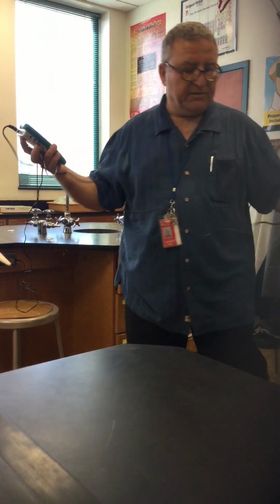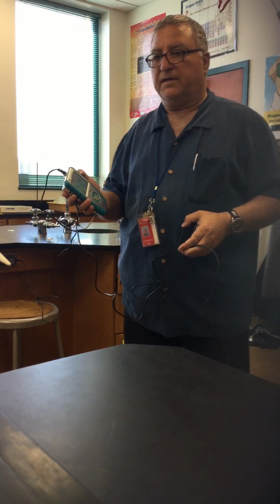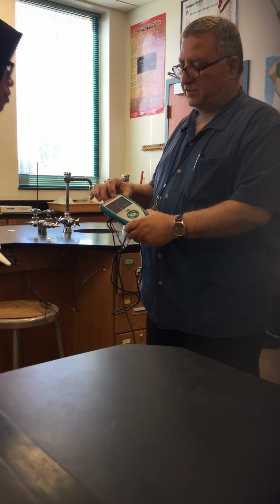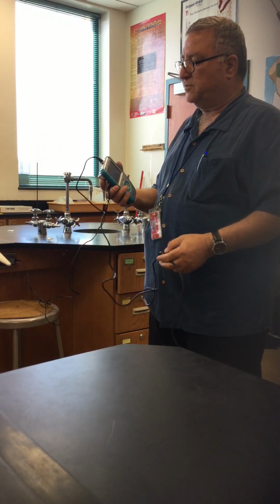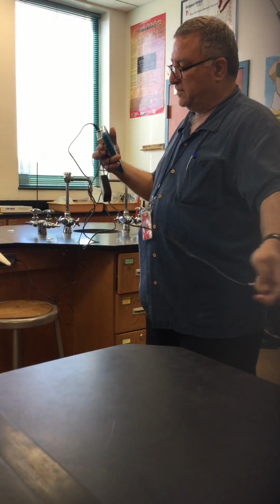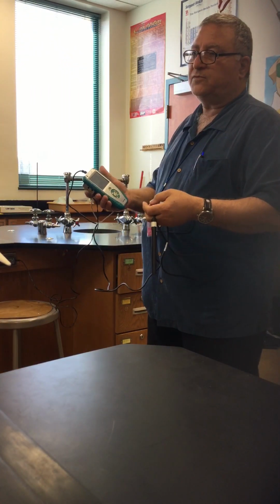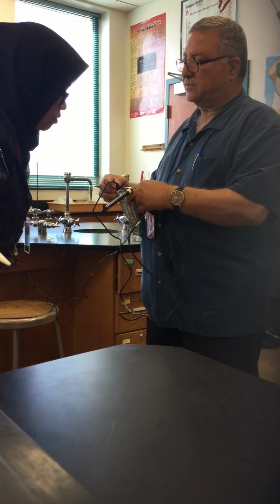Here is what we use to measure the conductivity of any solution. This is a very simple machine. The brand is LabQuest. What does it measure? It measures anything you want it to measure, depending on what electrode you use. This electrode says conductivity probe, so that's what it will measure.